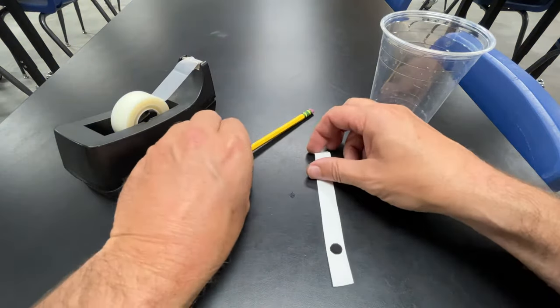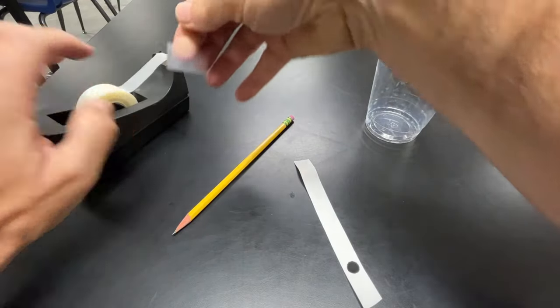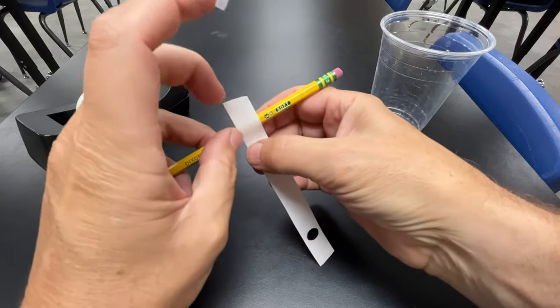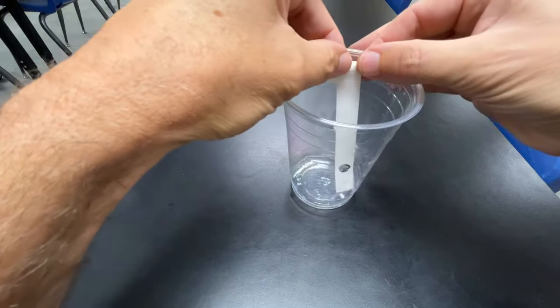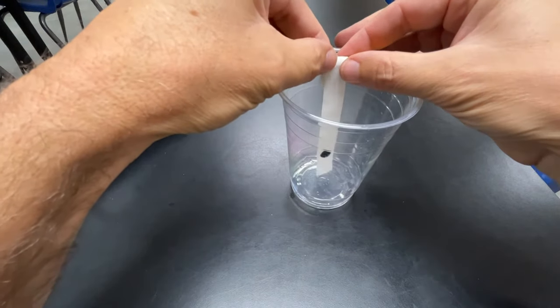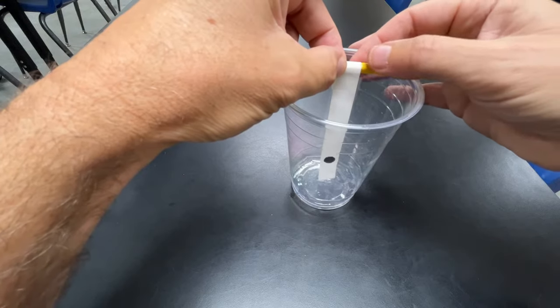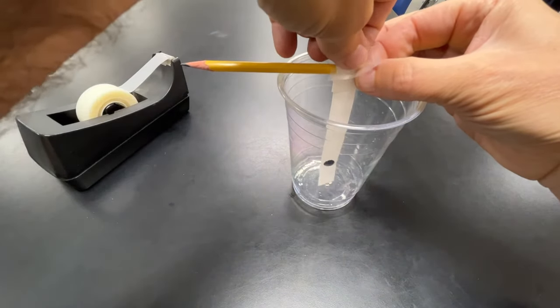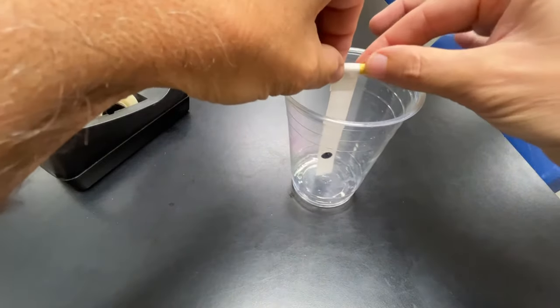Now for this step, we need a piece of tape and a pencil, the strip with the dot on it, and the cup that we're going to do this in. We want to make sure that the paper just reaches the bottom and can touch the bottom but does not bend too much. That looks good. Now I'm going to put a piece of tape across the top — and it looks like this.